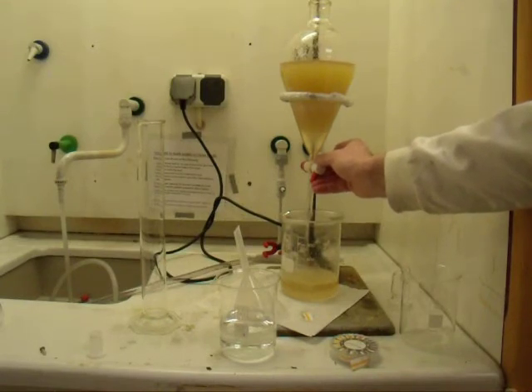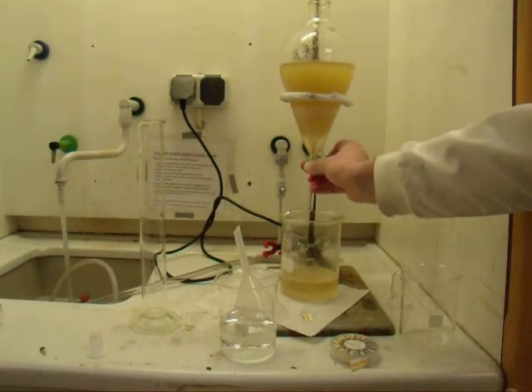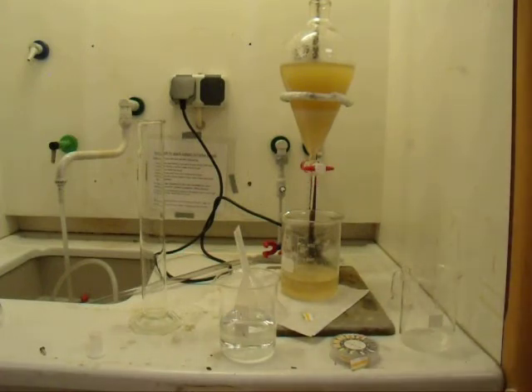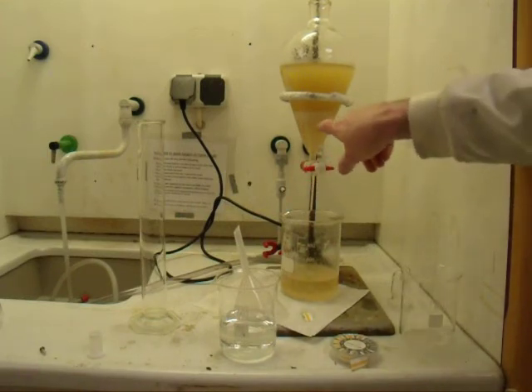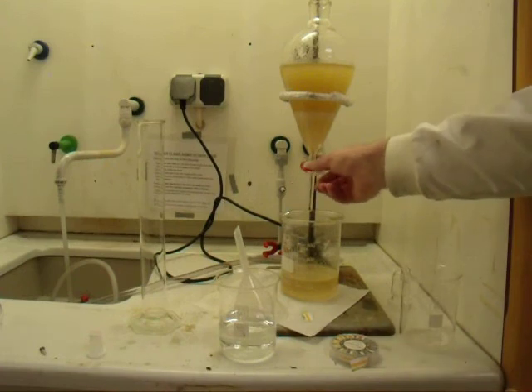We're losing a little bit of biodiesel into the beaker at the bottom, but that won't really matter too much. What we're aiming for is a nice clear biodiesel layer. As we continue this draining off process, you can see that you're getting less and less emulsion and hopefully more and more of a nice clear, clean biodiesel layer.